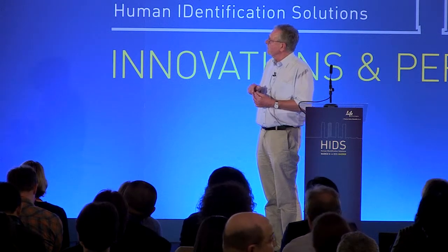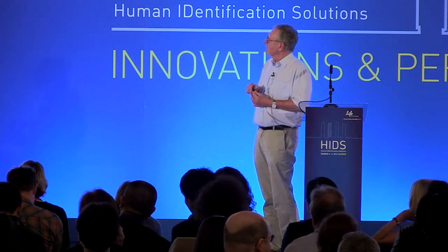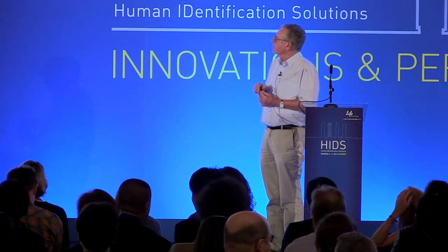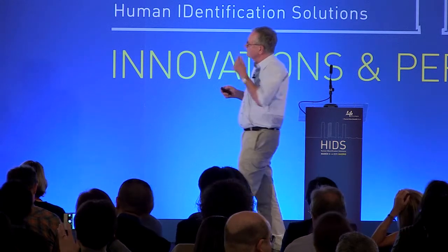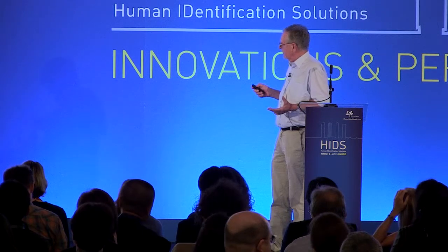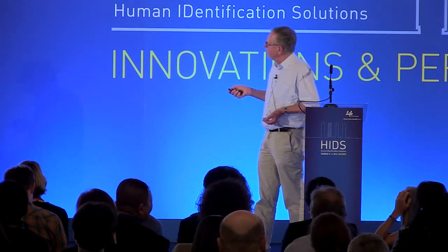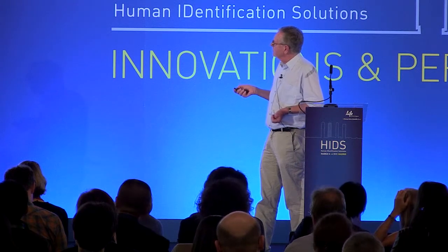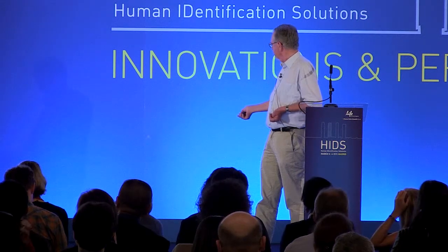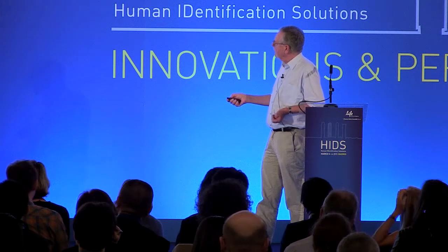And sensitivity, we typed some other groups. Here you see the results from some individuals who were typed with small amounts.